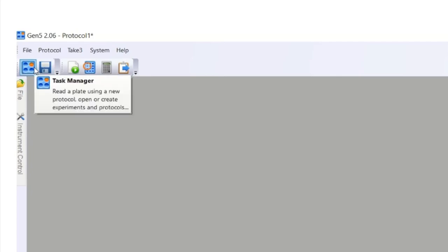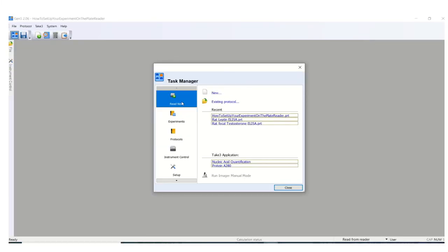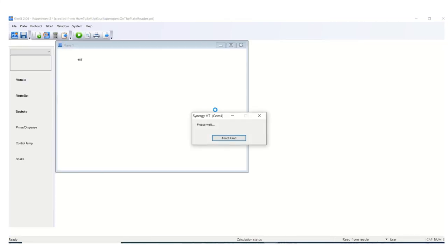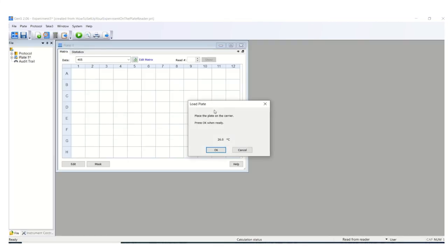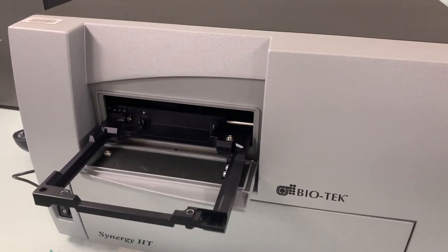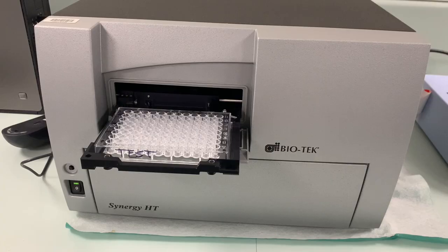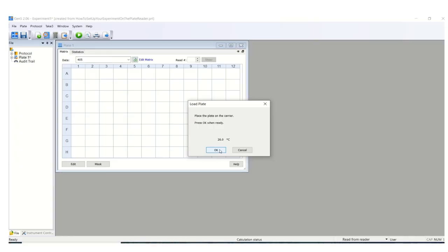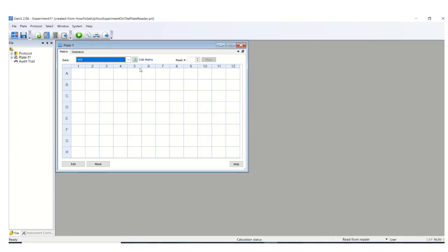Then it's time to read a plate. You want to use the Task Manager, so click on Task Manager, and you'll end up back with this dialog box where you can select Run. In the Run, you'll get the option to retrieve the procedure that you've just saved or any other procedure that you want, and then you'll be able to read the plate. You'll get a dialog box to tell you that the plate holder is now out and you can place a plate on it. Once you do, it will retract and start reading once you acknowledge by clicking OK.